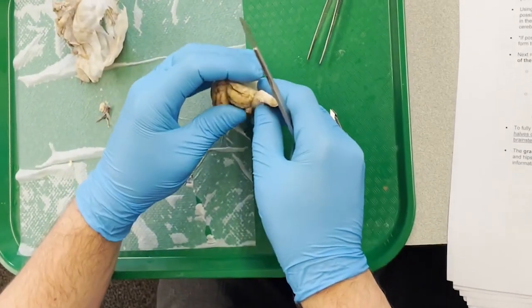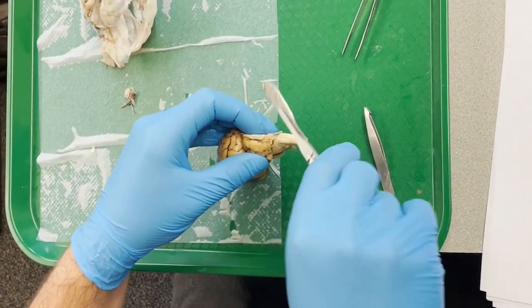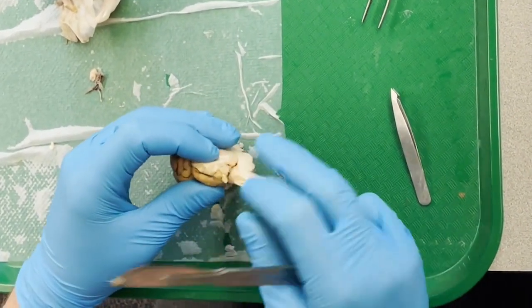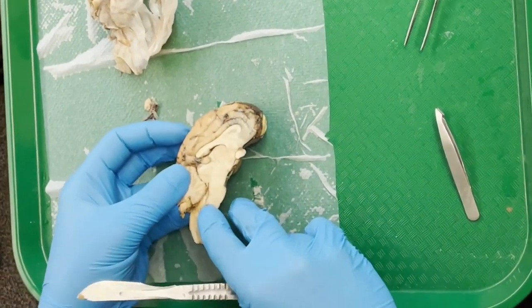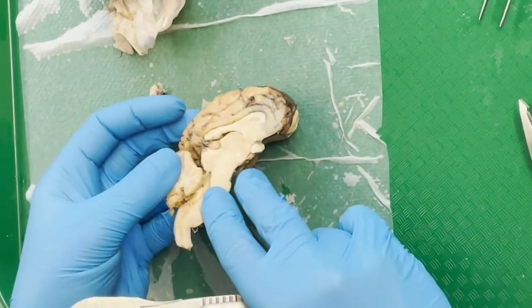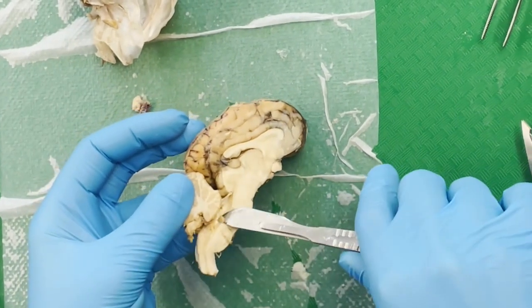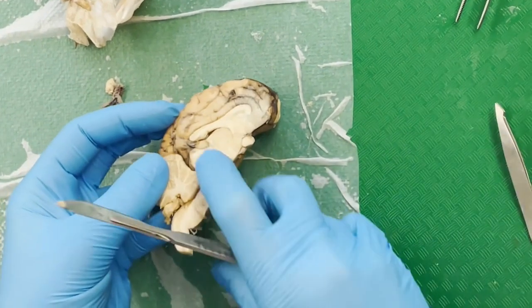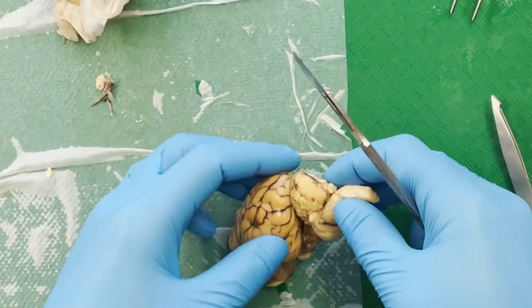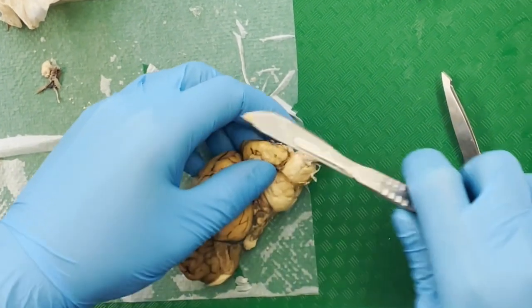Okay. And if there's pia mater kind of binding the cerebellum down a bit, you can cut through that just a touch to remove it as need be. But basically, as you pull up on the cerebellum and you look between the brainstem and the cerebellum, you will see that there are fiber tracts that are kind of keeping it adhering on here. It doesn't just pop off. You can also try going in from the outside and looking at the same thing.